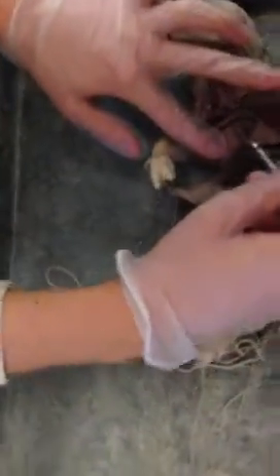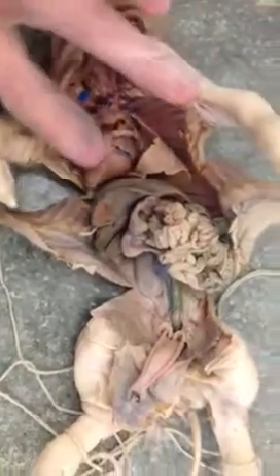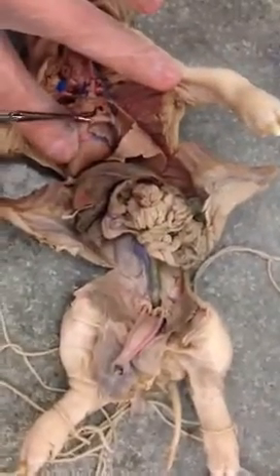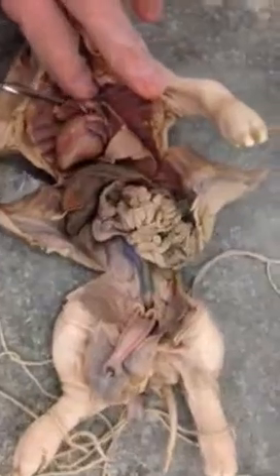Sure. Okay, so there's a couple of heart modifications for the fetal pig. This structure right here, coming out of the right ventricle, is the aortic arch. Right underneath that is... Oh, I messed up. No worries. Okay. That's not the aortic arch. That is the pulmonary trunk. So coming out of the right ventricle is the pulmonary trunk. And right under that is the aortic arch.